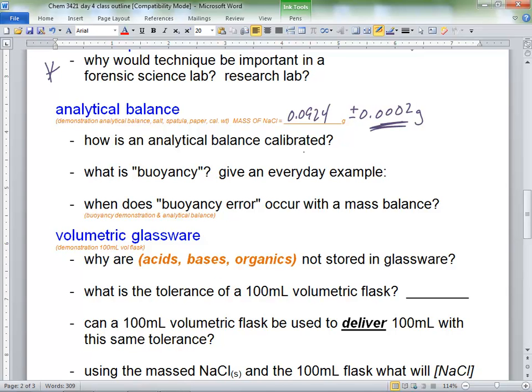I'm working on a revised way to teach general chemistry lab, and one of those activities involves, where's my syringe? Oh, here it is. One of those activities involves taking a Bic lighter, release it, let go. What's the new mass of the lighter? And you got to predict it. Okay? And in developing that lab, I learned about buoyancy on my own. I've always heard about buoyancy, but what the hell is it? With balances, buoyancy, buoyancy, buoyancy. You have buoyancy air. Okay.